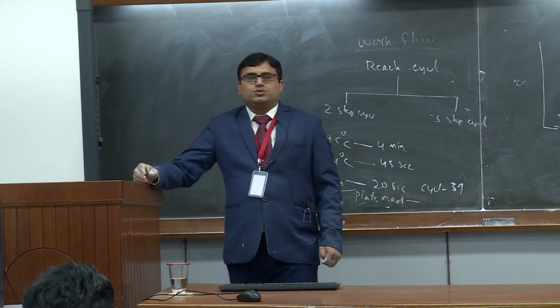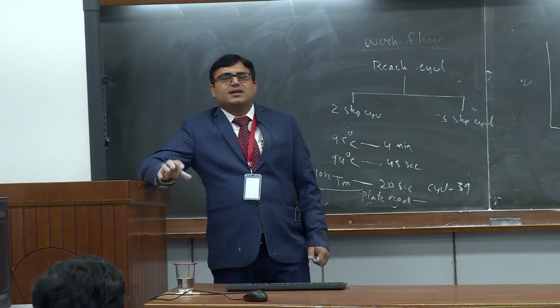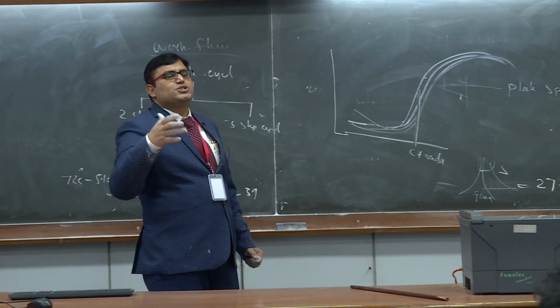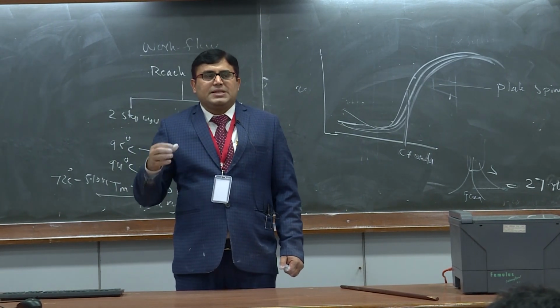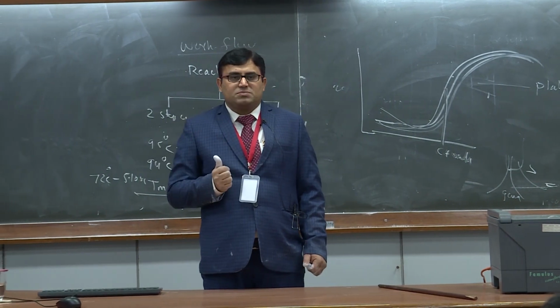Right? Now once we have this CT value, there is a specific mathematical method to calculate with, even though most instruments have inbuilt software. This software will calculate and tell you the expression of your gene. But manually also you should know how to calculate the relative fold expression, right?